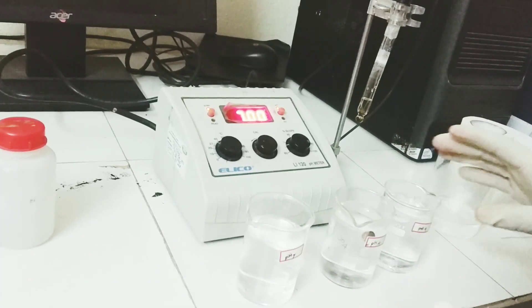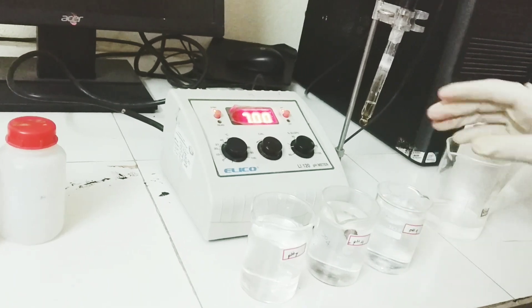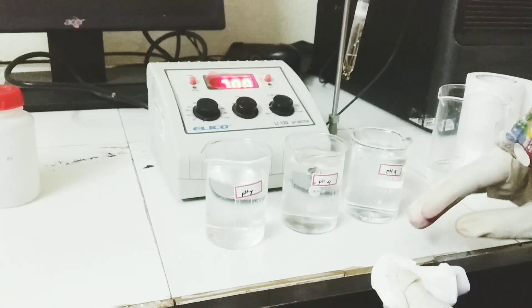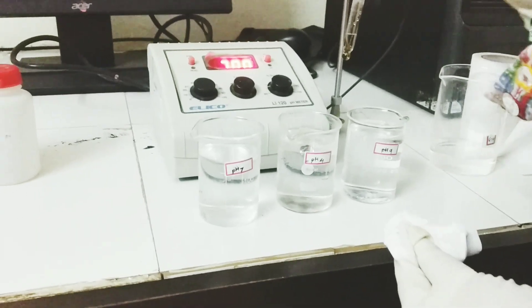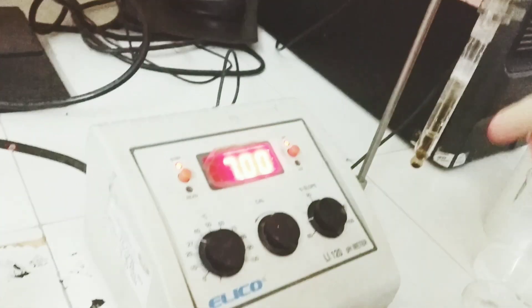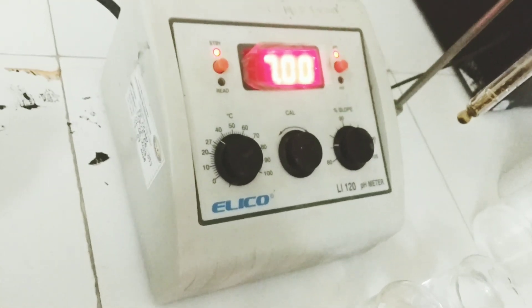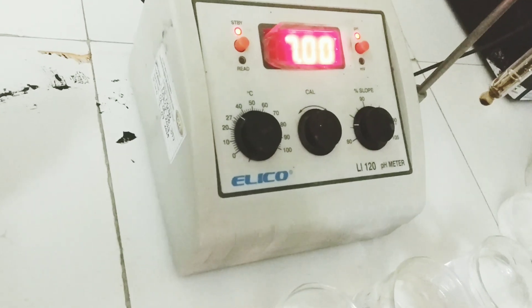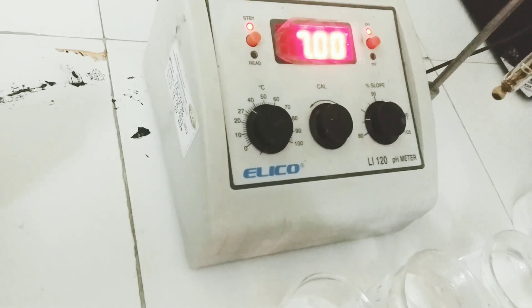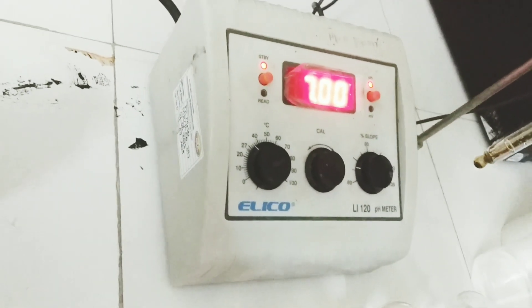This is the first step of the calibration. What I have done is, using pH 4, pH 7, and pH 9 buffer solutions, I have adjusted a standard value in the instrument using the cal knob and slope knob. Now the second step is: when we place these buffer solutions again, the instrument must automatically show these adjusted values. Then we say the instrument is calibrated.